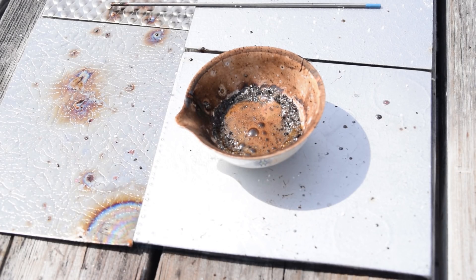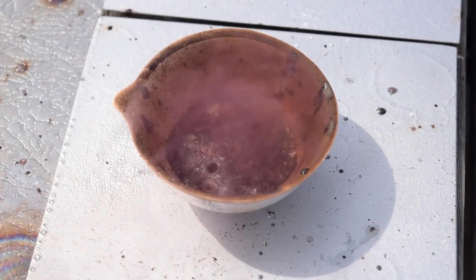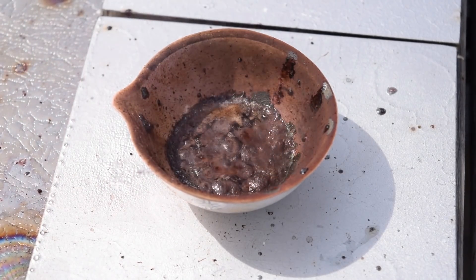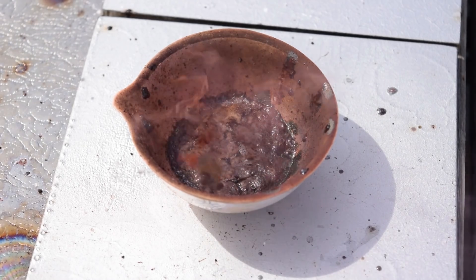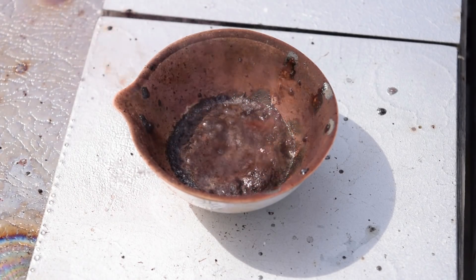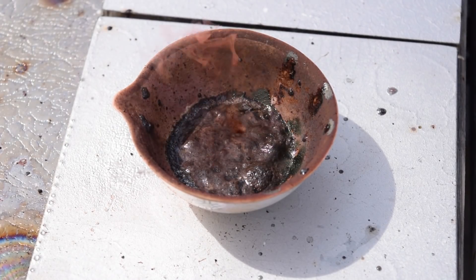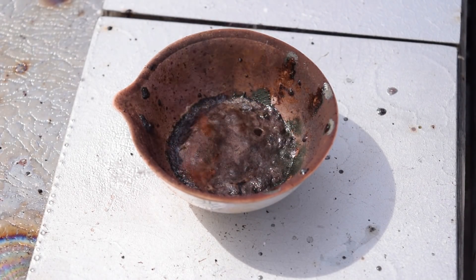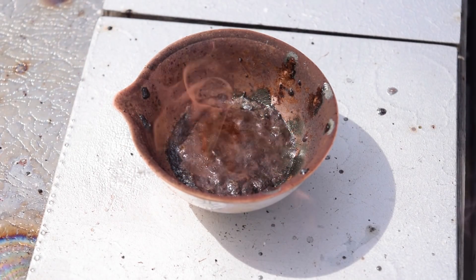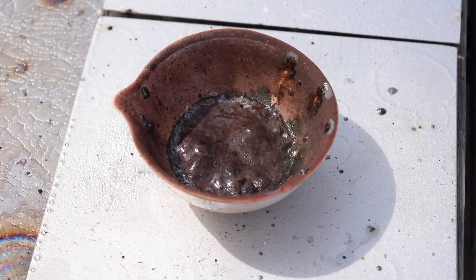That was all right. Let's move on to the next thing. Here's some erythritol. Here we go — not bad, it's more like it. Let's move on to the next thing.